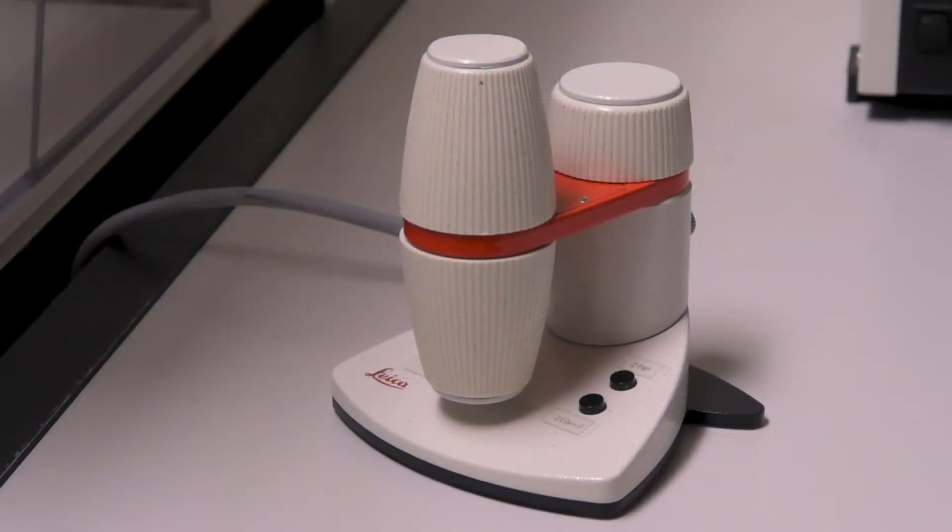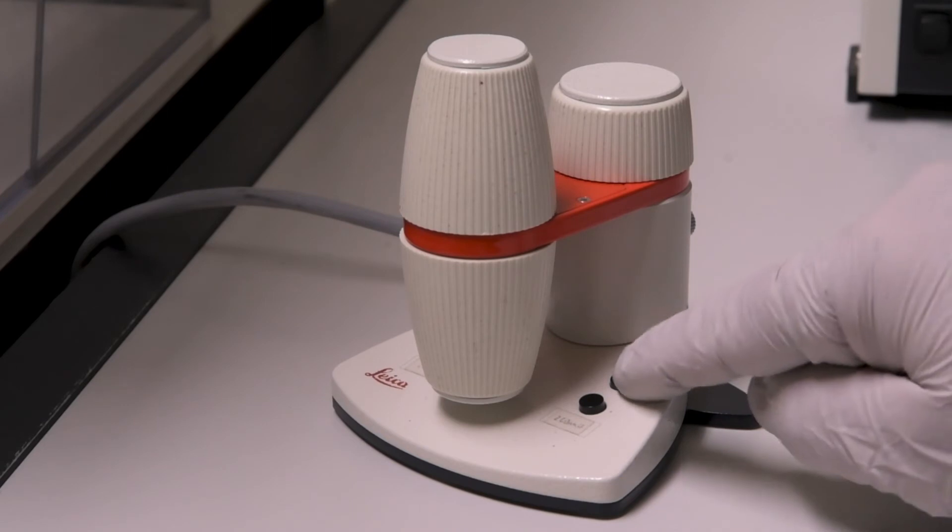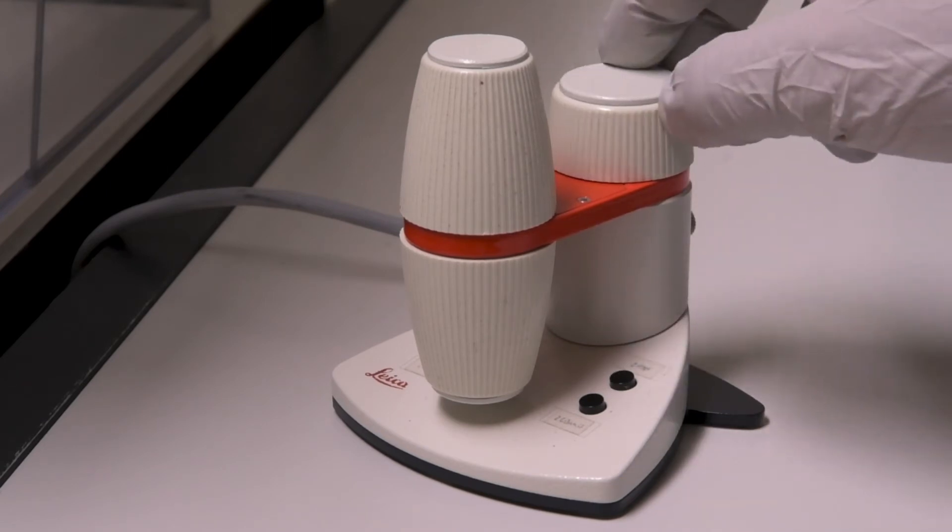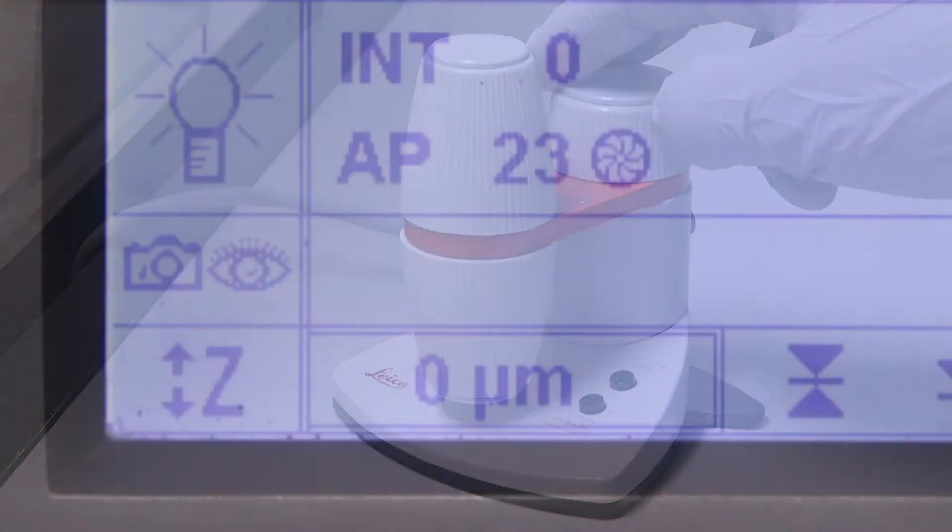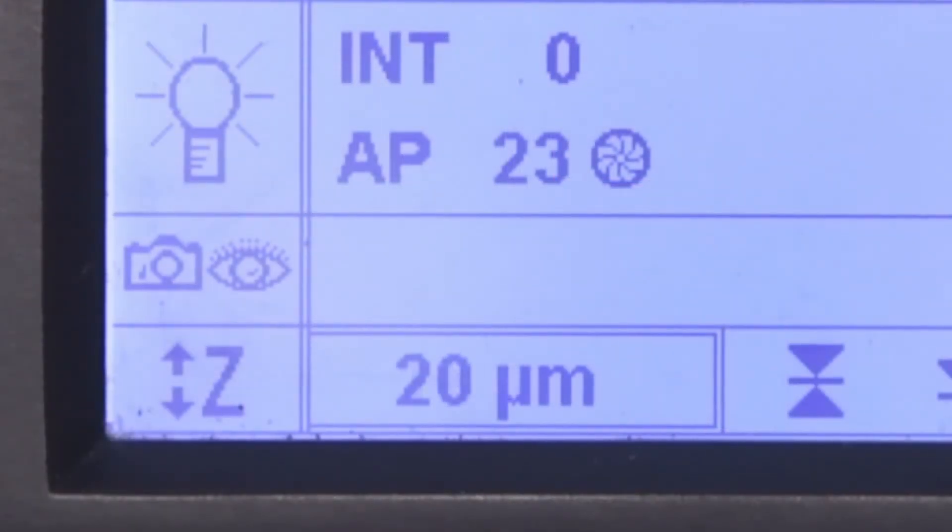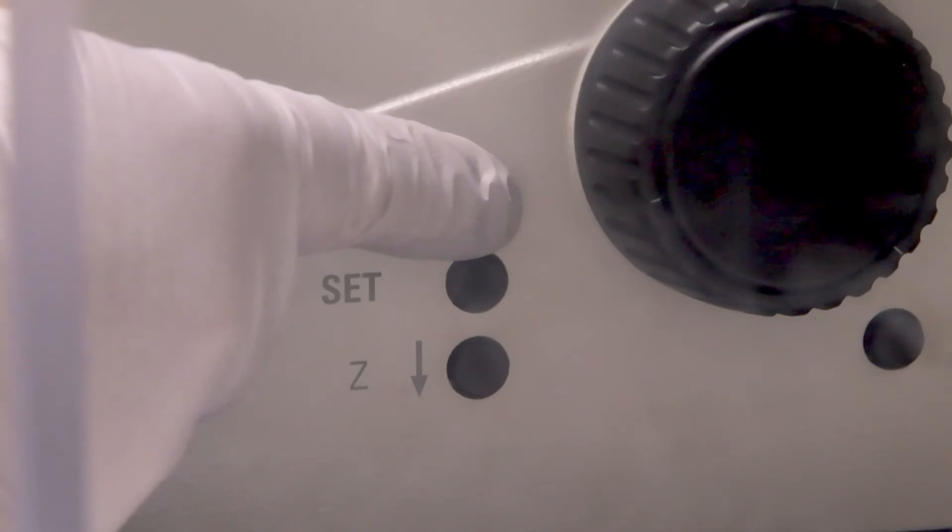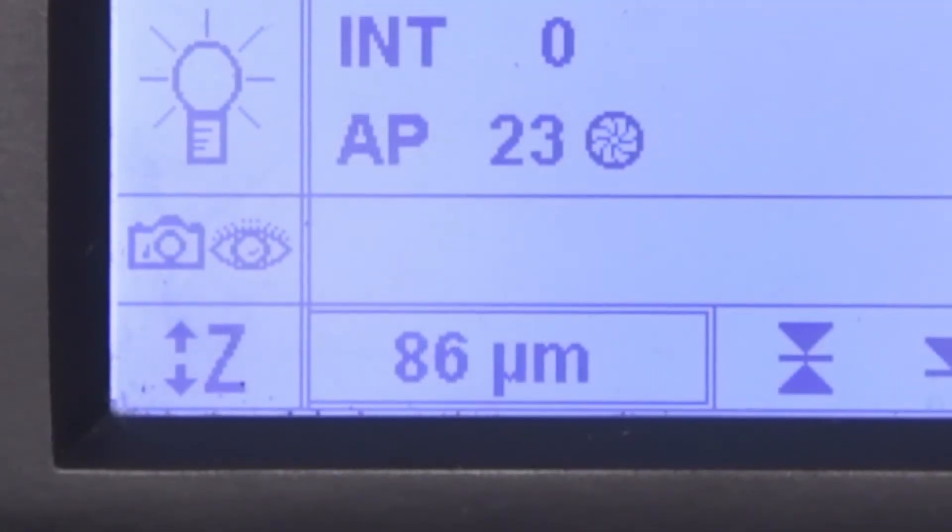At this point, the only way to raise the objective higher is by using the Z-focus knob on the salt and pepper shaker. As you go higher, up into the plus Z range, the lens will be pushing upwards. If you stop at a higher position but want to get back to the zero, all you have to do is push that top button again. Remember, it brings you back to the zero position always, whether you're above or below.